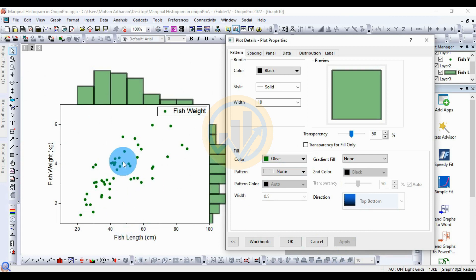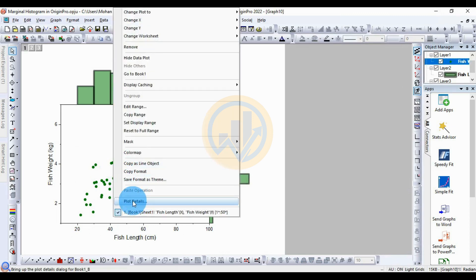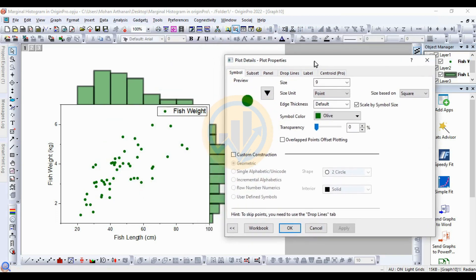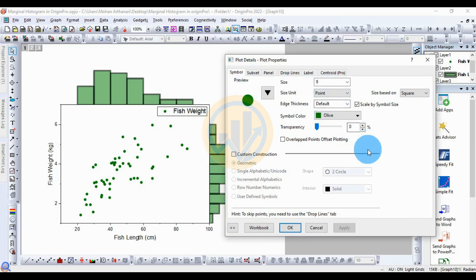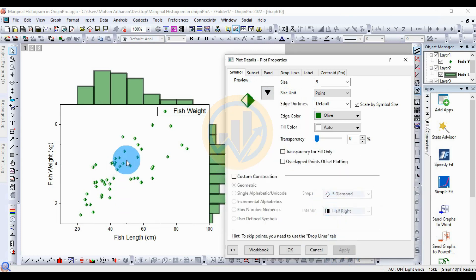Next, customize the scatter plot symbols. Right-click on the scatter plot and choose Plot Details. Open the Symbol sub-menu to see a preview of available symbol options. Click the button to see many different symbol choices and select your preferred symbol, then click Apply to change it.